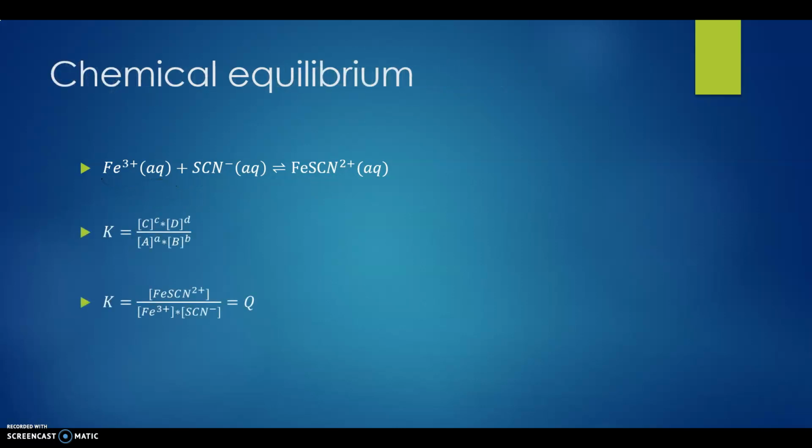The equilibrium constant can be calculated with the equilibrium expression, which we see here. But the result of the equilibrium expression can change, differing from the equilibrium constant, when adding either some reactants or products, causing a stress. The ratio between reactants and products will be different from before the stress, which was the purpose of our experiment, disturbing a chemical equilibrium, as seen in our different test tubes 1, 4, 5, and 6.